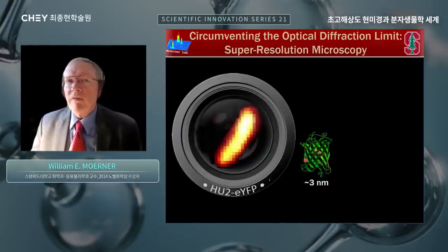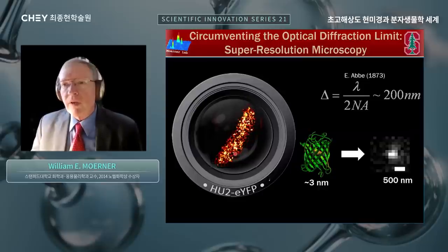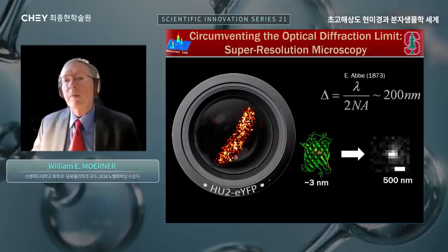And that's because even though the fluorescent labels attached to specific proteins are just a few nanometers in size, they appear to be a few hundred nanometers in size due to optical diffraction, an idea from Ernst Abbe back in the late 1800s. So that's the problem of diffraction-limited imaging. But super resolution imaging produces from this cell this kind of an image with far more detail. And it's many, many times beyond this diffraction limit, down to some tens of nanometers. So I'm going to explain how that works.